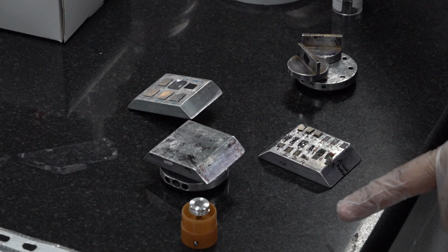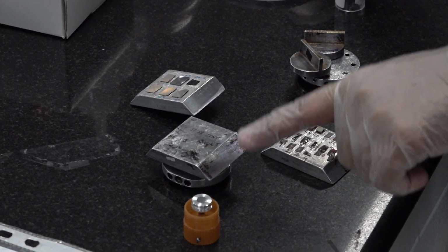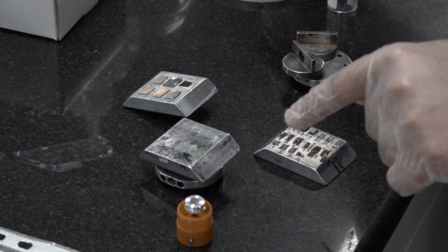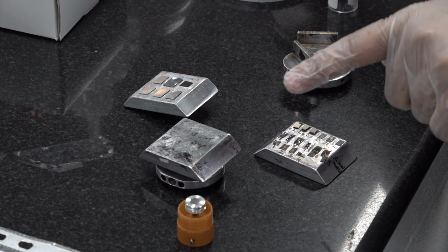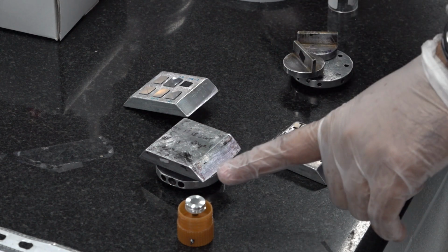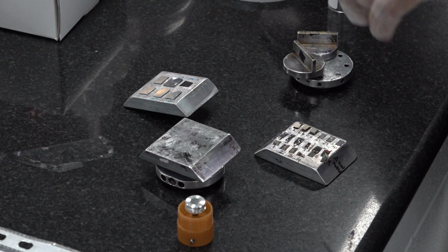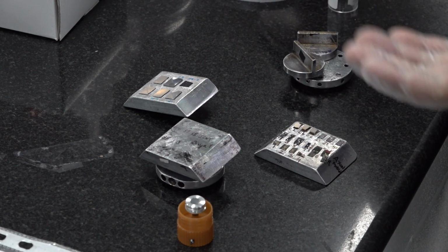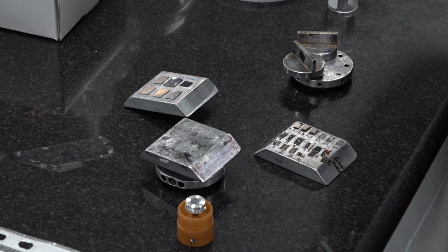What we are going to do is image this sample up to 2 lakh magnification. Generally, 90% of the users use secondary electron imaging up to 50,000 or 1 lakh. Here we are going to image this sample up to 2 lakh, and also we are trying to find out different kinds of signals. I will explain in a minute during the pumping operation what kind of signals and detectors we utilize for different operations.